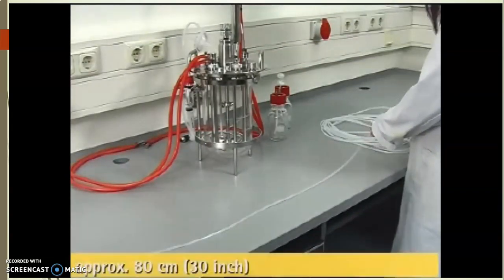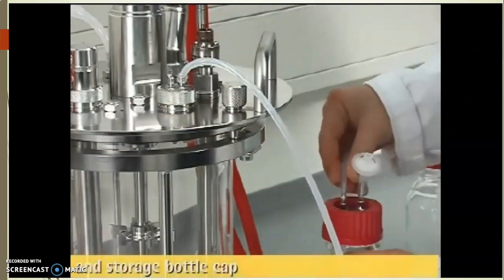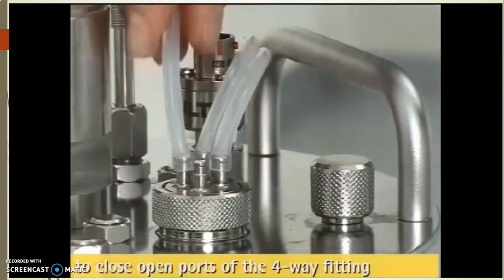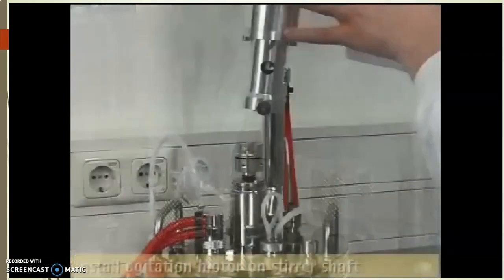After that, this is the corrective, that means the pH controller for acid and base dosing. So the acid and base dosing lines should be connected to the 4-way coupler.